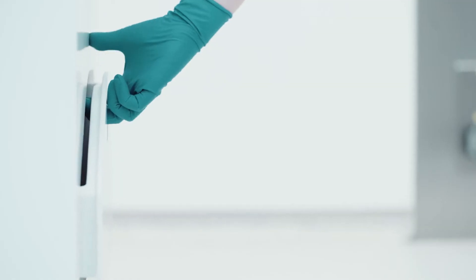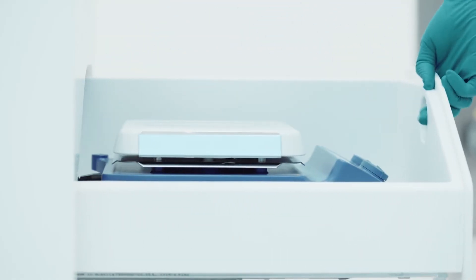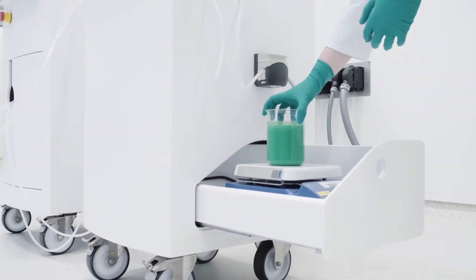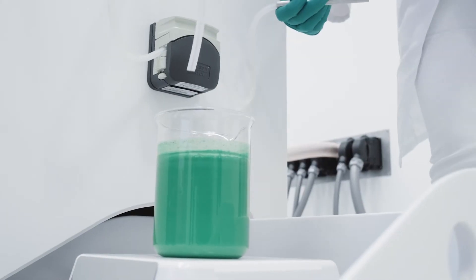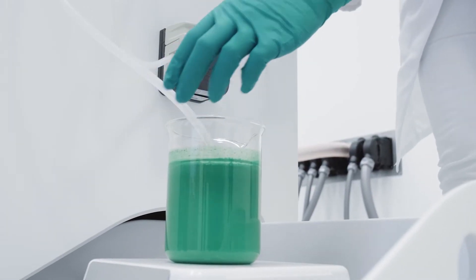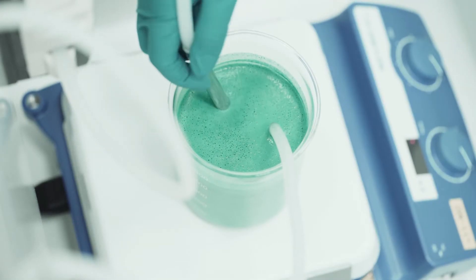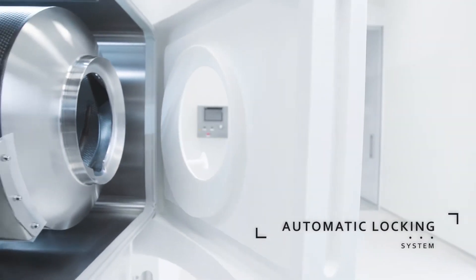In this step, either an external pump or, as an option, the Ludger liquid supply station with a mass flow meter, magnetic agitator, and return valve can be used for spray rate regulation. A magnetic system is used to close the door.